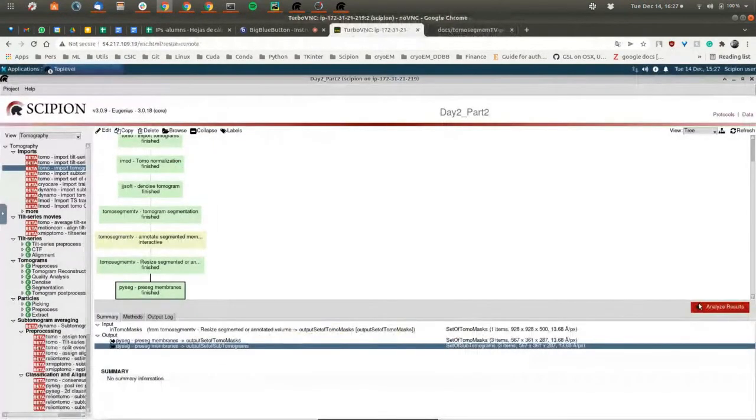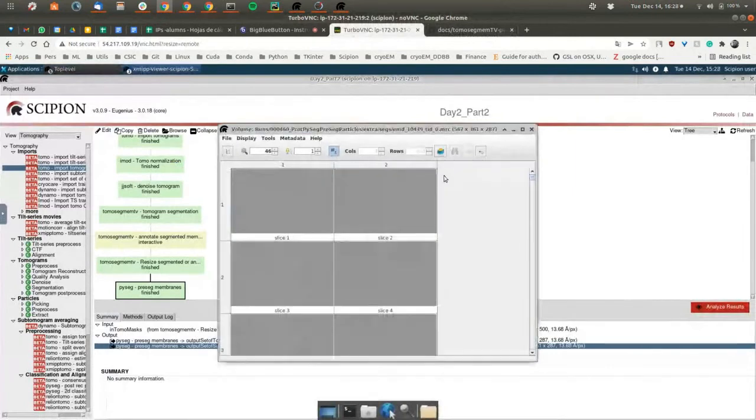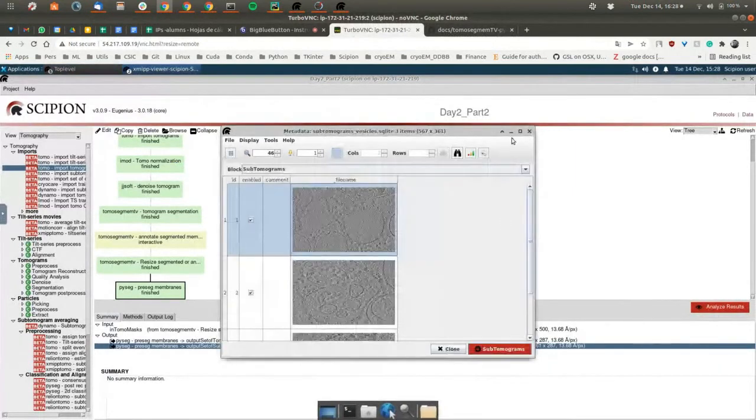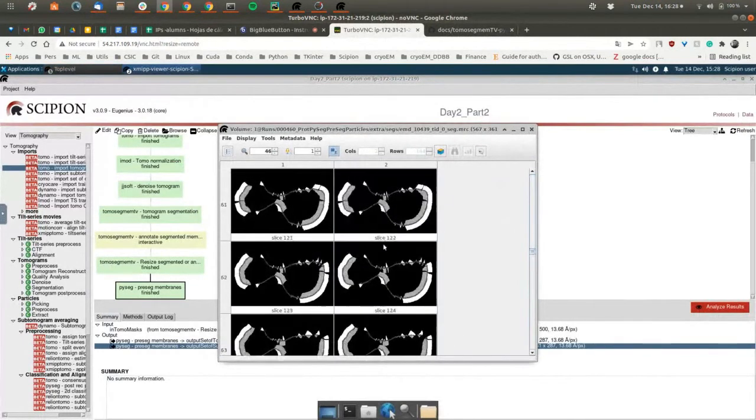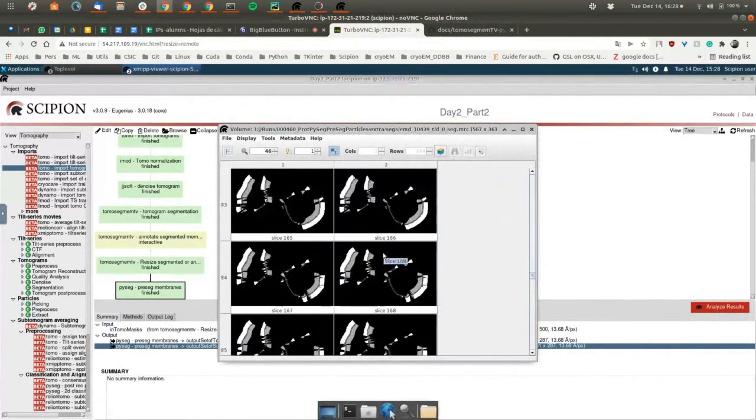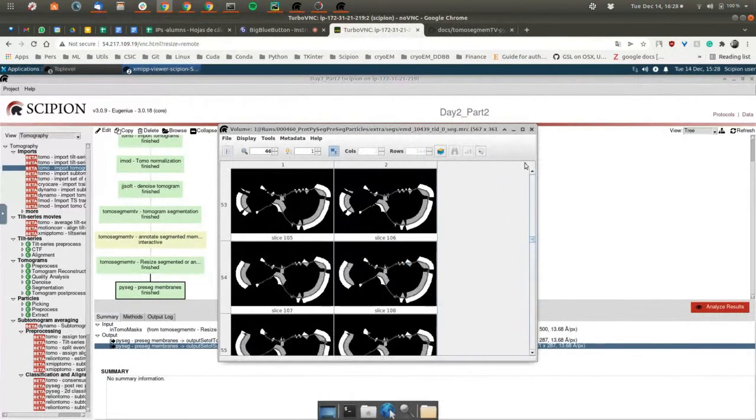The segmentation is not complete, but it covers as much as possible. So in all these areas, graphs will be traced. And this is what we are looking for. Not always in the real case are you able to have a perfectly rounded segmented vesicle, and sometimes you have something like this. But playing with the parameters as before, we can cover as much of the membrane as possible.